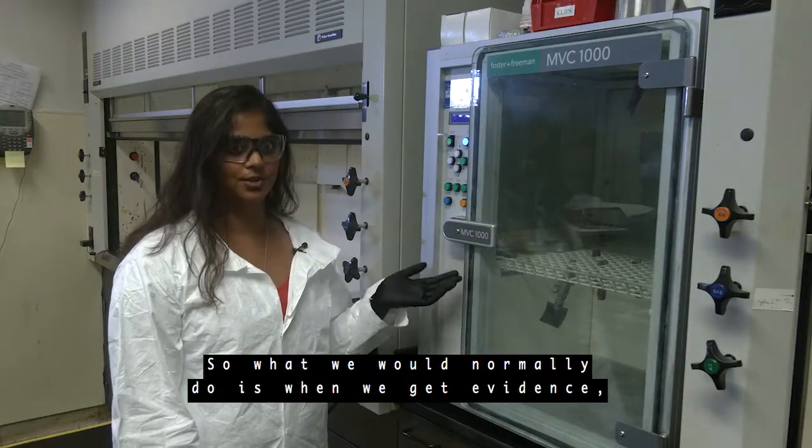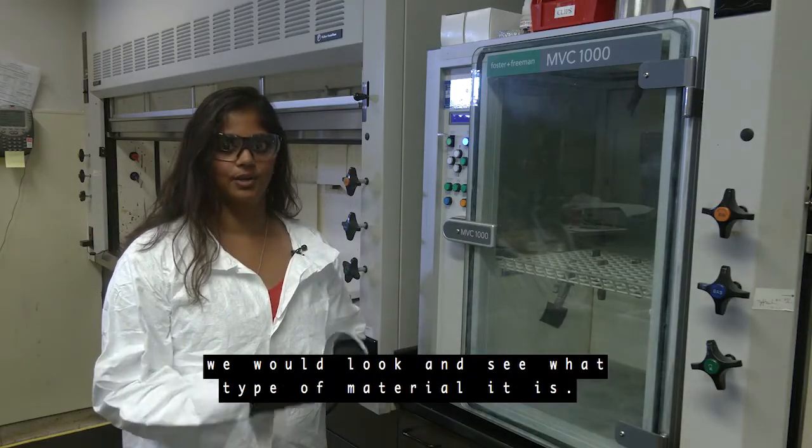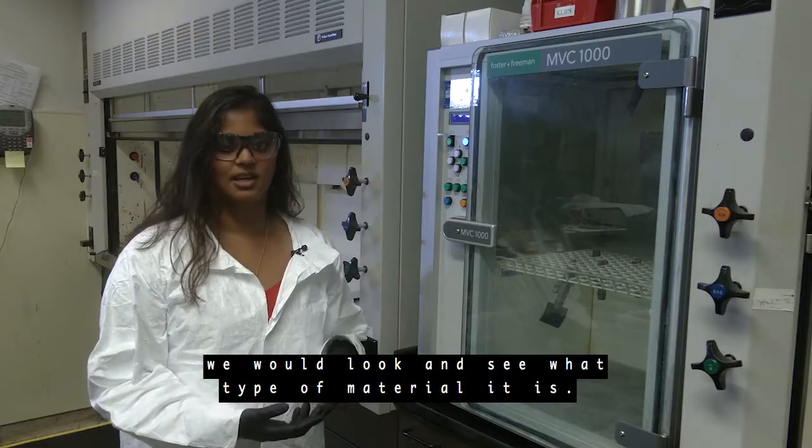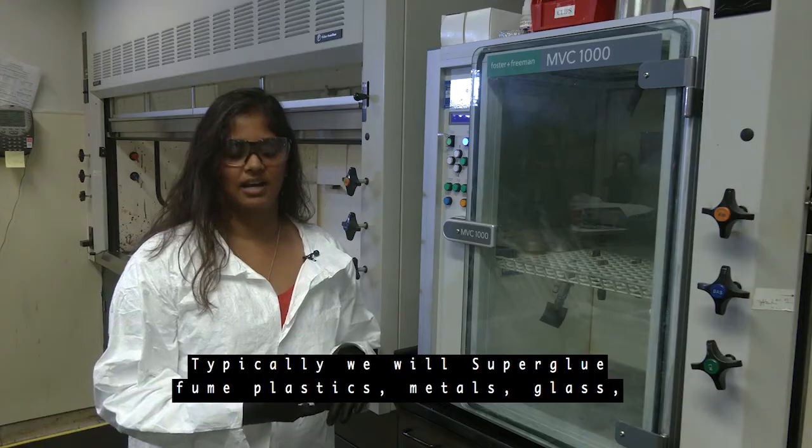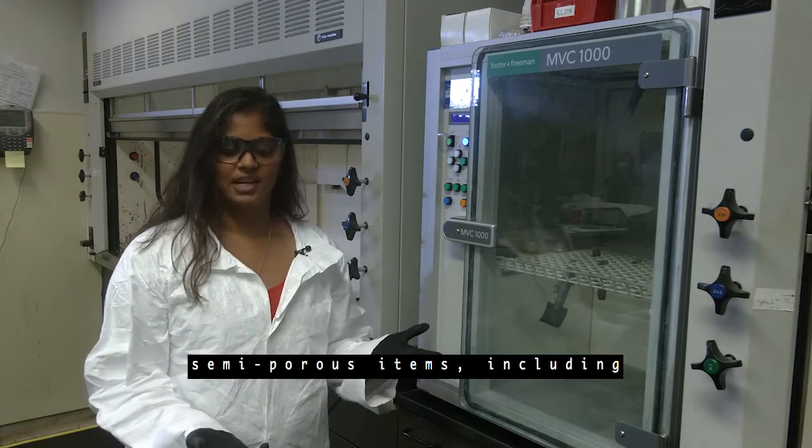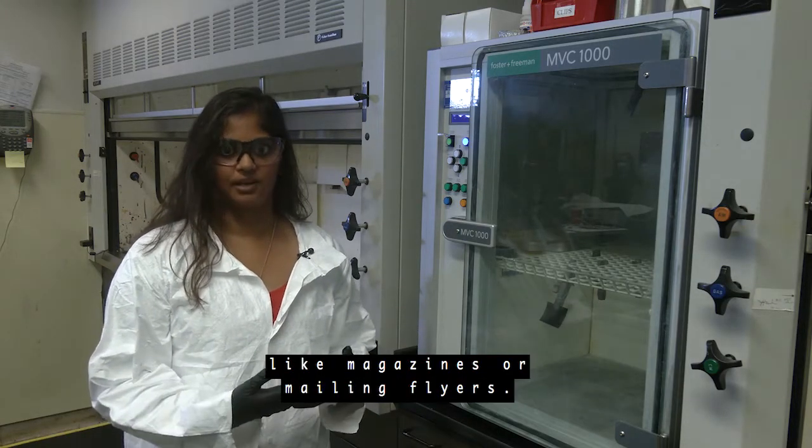So what we would normally do is when we get evidence we would look and see what type of material it is. Typically we will superglue fume plastics, metals, glass, semi-porous items including magazines or mailing flyers.